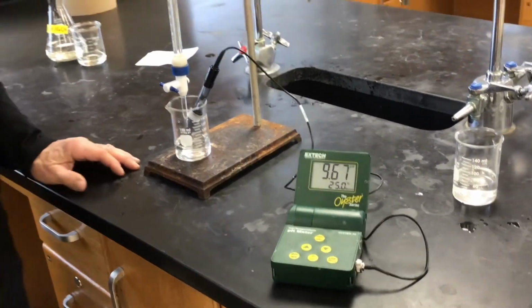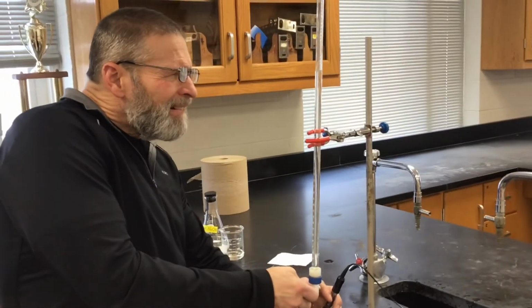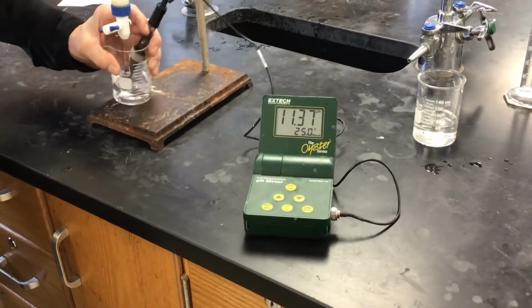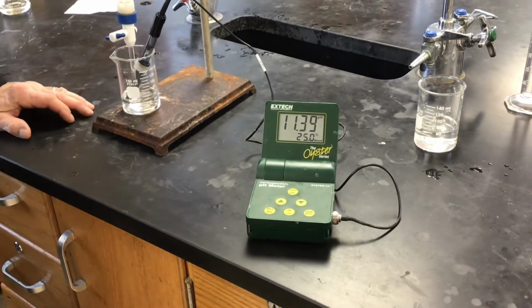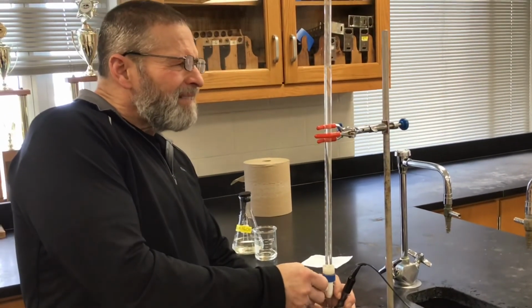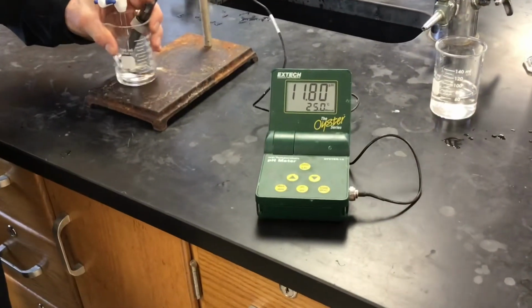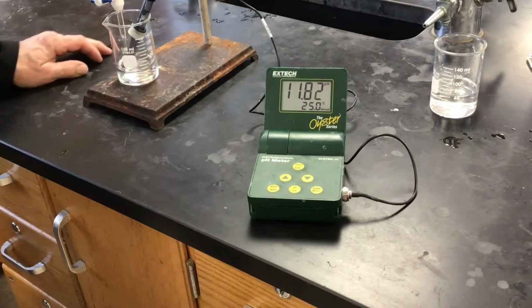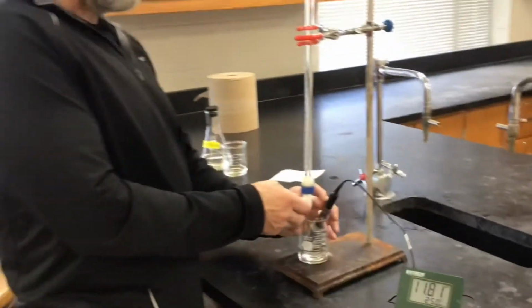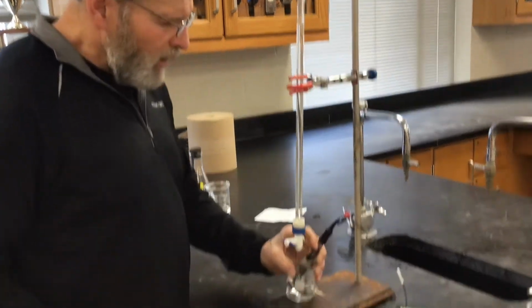Okay, 9.66 for 18. Or is that 18.5? You're at 18. There's 18.5. Okay, that's good. There's 19. And that's fine. We go up by a full milliliter again. There's 20.